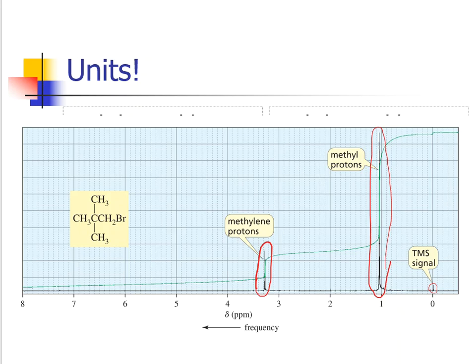So I want to connect the dots now. These chemical shifts are the signals that we have talked about in previous videos. If you go back and take a look at all of the example problems that we did, looking at the number of signals from the compound, this is really what we're referring to. These are the signals that will show up on the NMR. So for instance, here is the molecular structure for what you're seeing on the image.